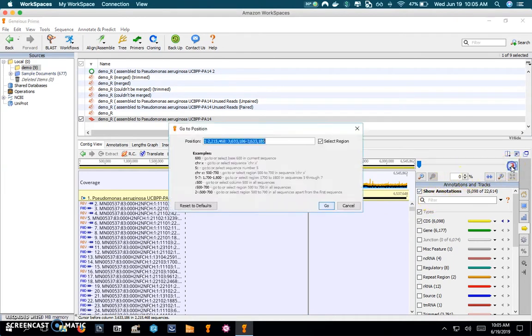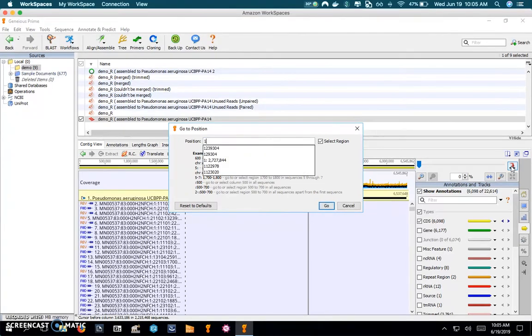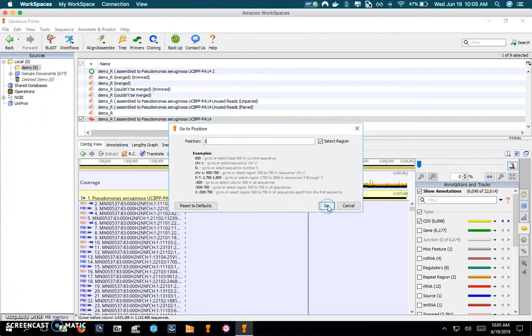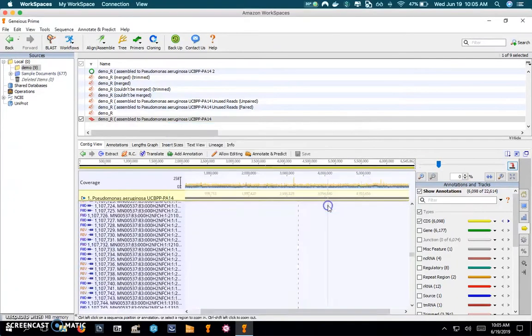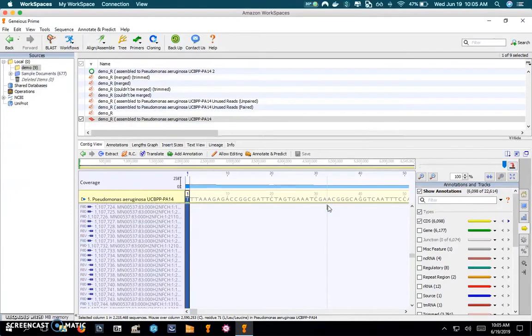There's another option on the right here where we can go to a specific locus or region of the genome, and in this case I want to go to the first locus. We'll click there and that takes us all the way to the left.